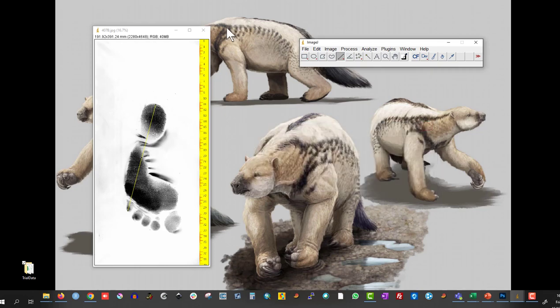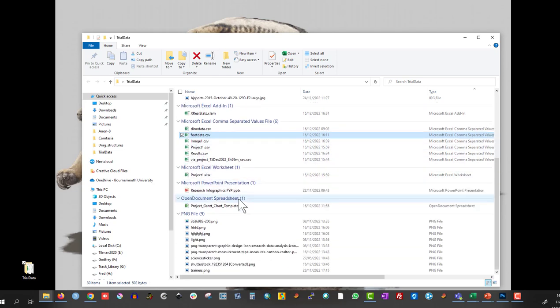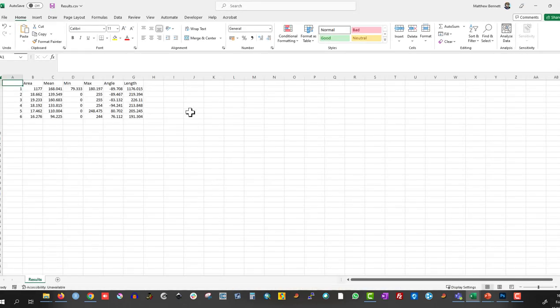So I don't need that anymore. I don't need that anymore. I don't want to save the changes. Bye-bye. And then all I need to do is now find where my results are. And what did I call them? What did I call it? Okay, there it is. And that's my data popped out here, and there's my measurements.